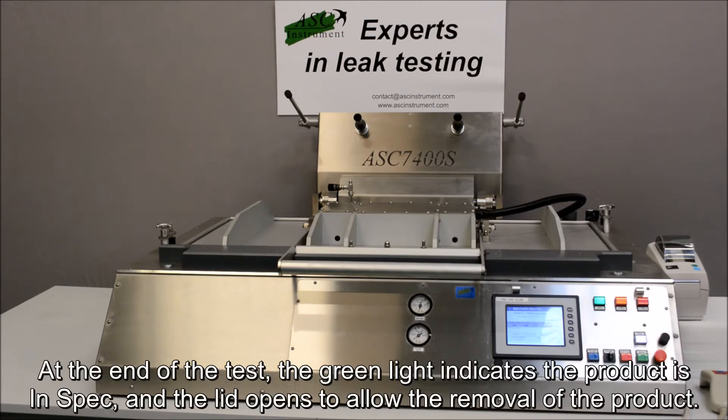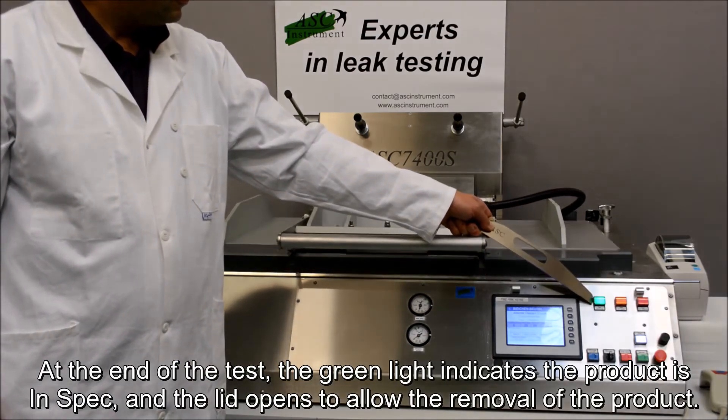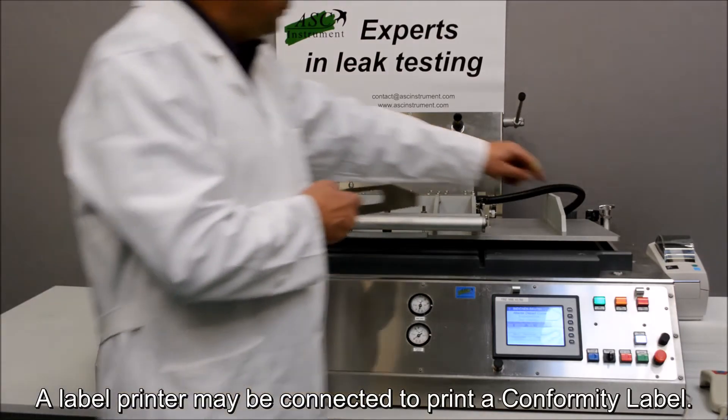At the end of the test, the green light indicates the product is in spec and the lid opens to allow the removal of the product. A label printer may be connected to print a conformity label.